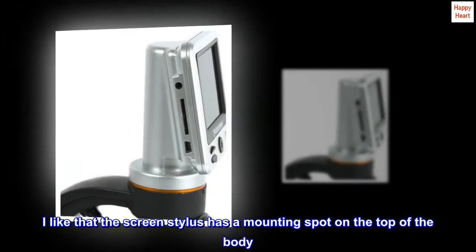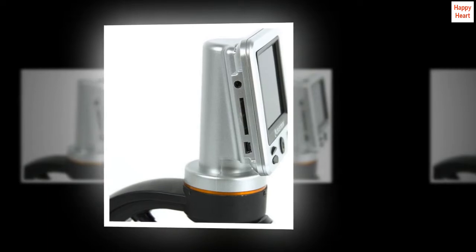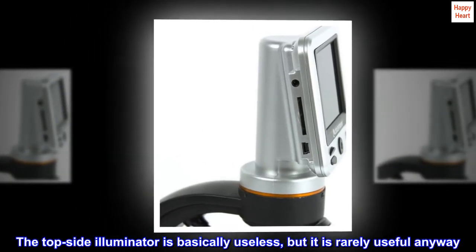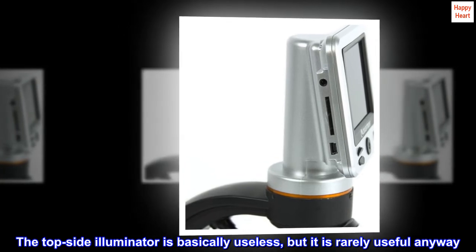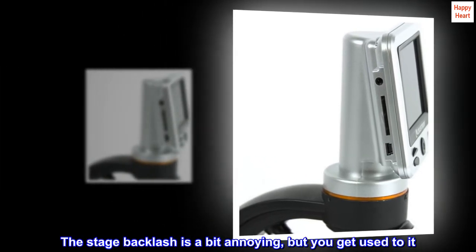I like that the screen stylus has a mounting spot on the top of the body. The topside illuminator is basically useless, but it is rarely useful anyway. The stage backlash is a bit annoying, but you get used to it.